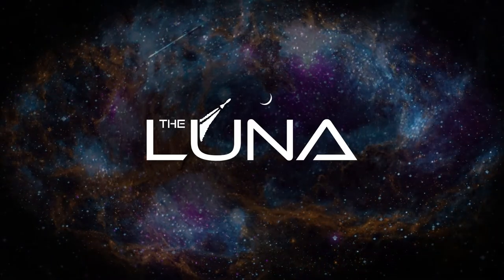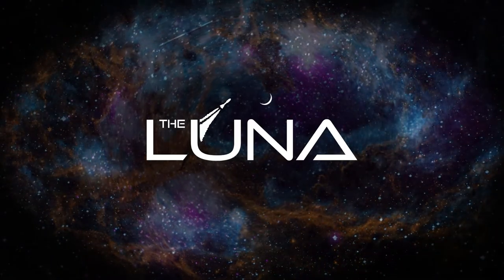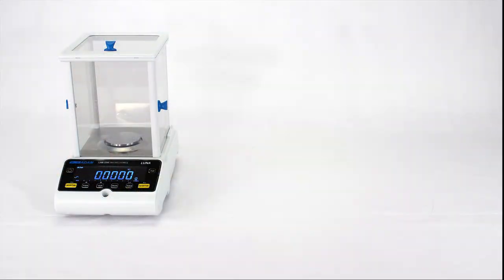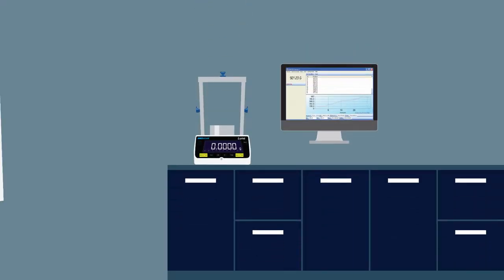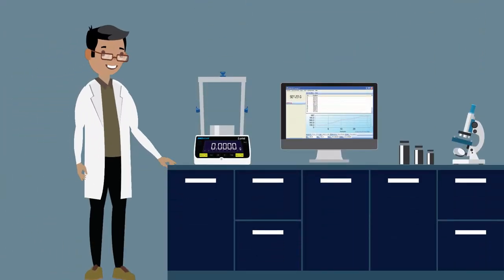Introducing the LUNA range of analytical and precision balances from Adam Equipment. Take one small step toward excellence with LUNA, the perfect everyday lab balance. Combining an elegant form with intuitive function, the affordable LUNA is packed with all the applications and features your lab needs without being weighed down by those you don't.